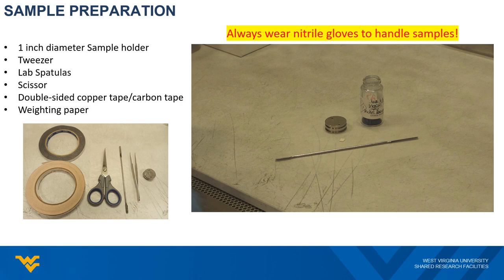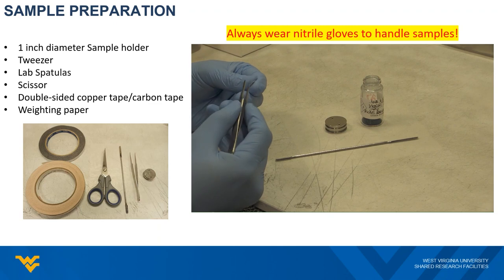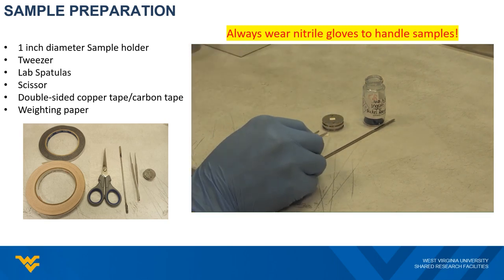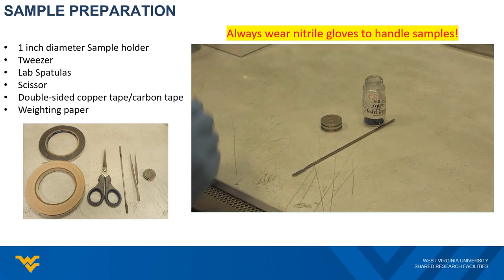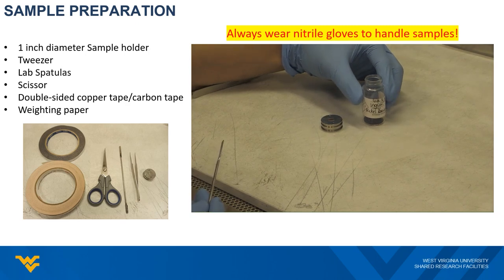Here is a video to show you how to prepare the powder sample. We are using a 1-inch sample holder. I cut a small piece of double-sided copper tape and attach it to the sample holder. After removing the top cover of the tape, pick up your powder using a spatula and apply it on the tape.